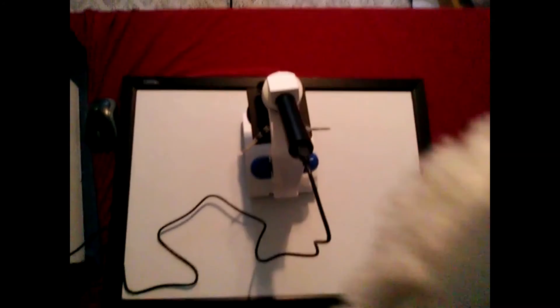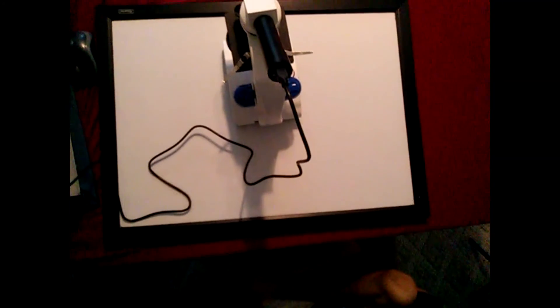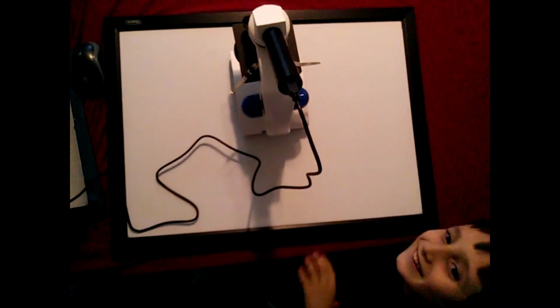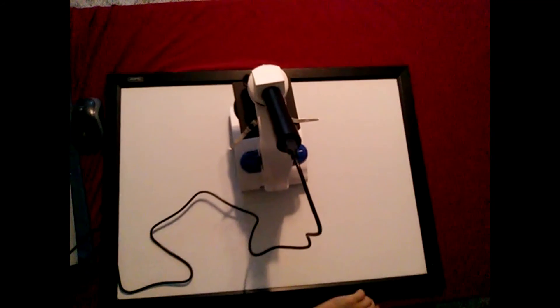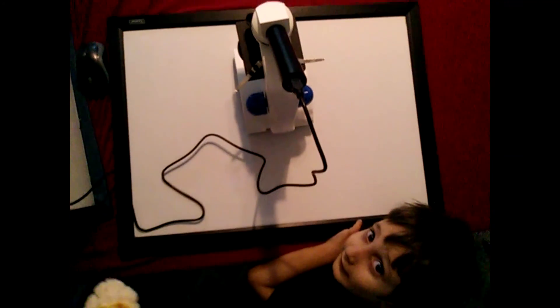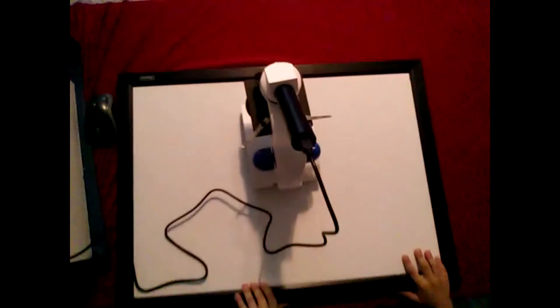I see Loki's paw. You do? Yeah. Wait, how did you get all the way up there? I'm wearing the stilts again. What does it look like? It looks like me and the microscope. Actually, pop the microscope instead. Look at this piece.